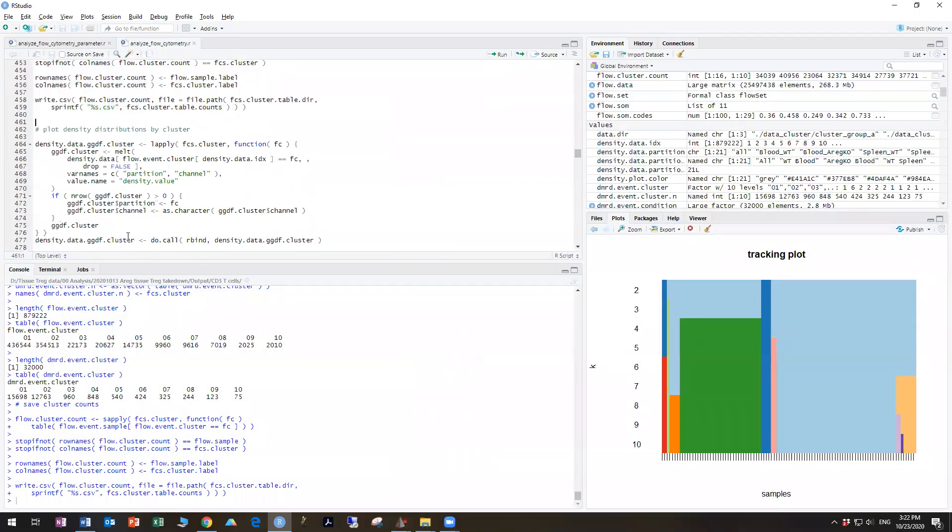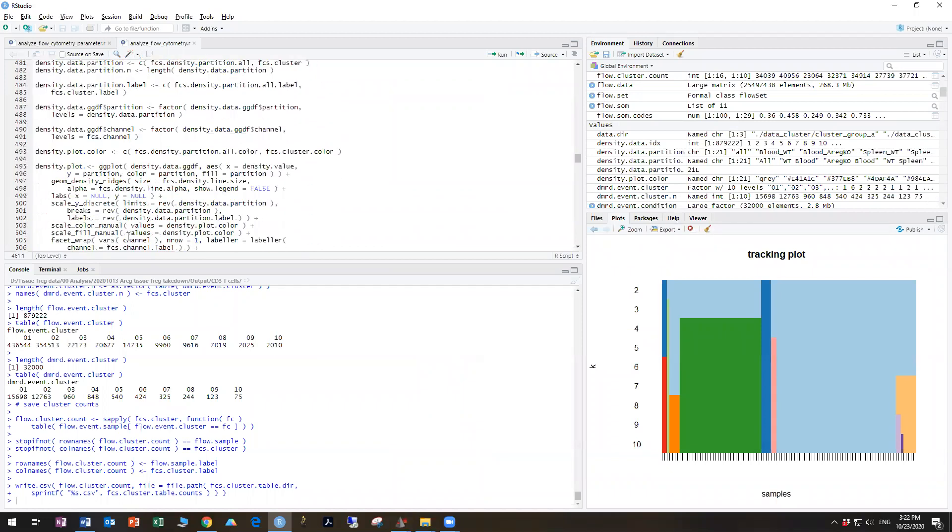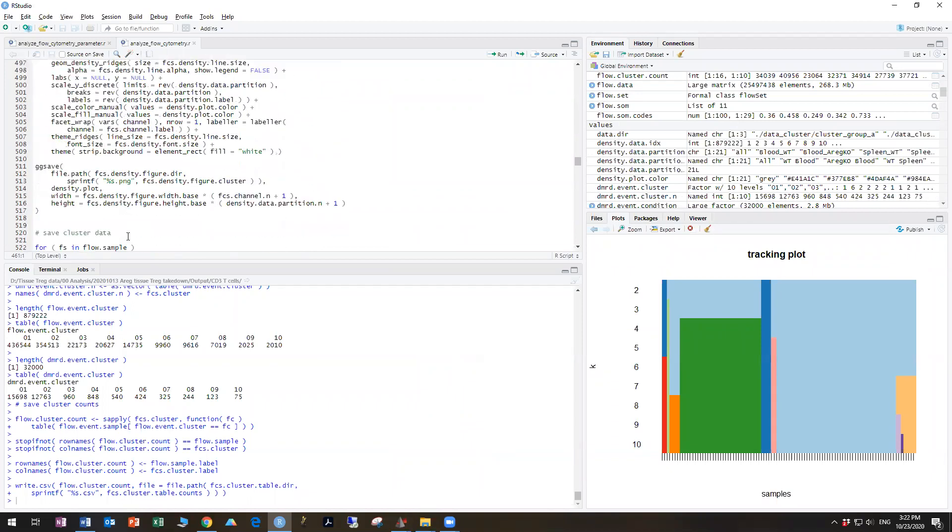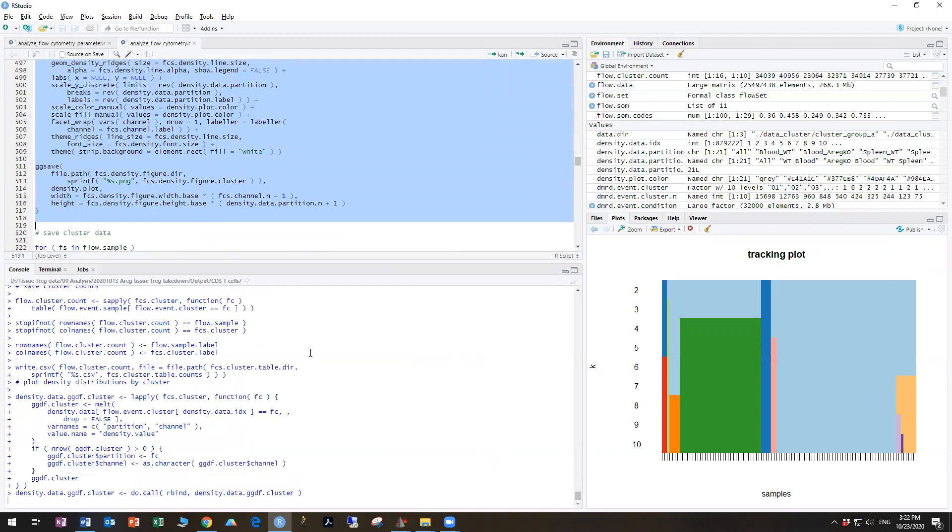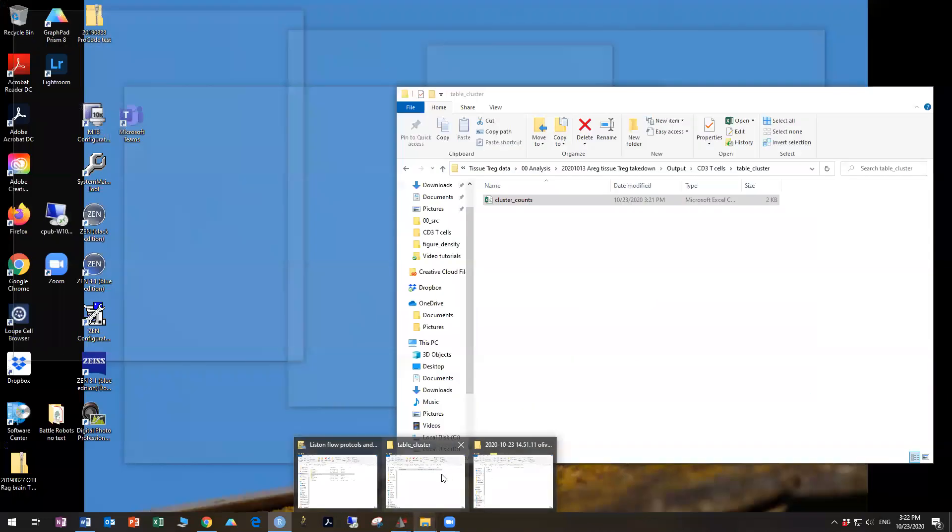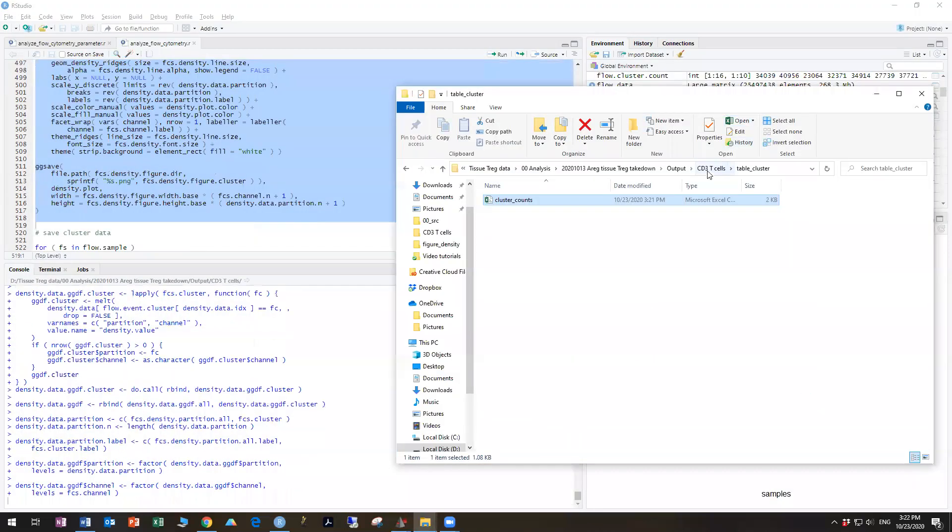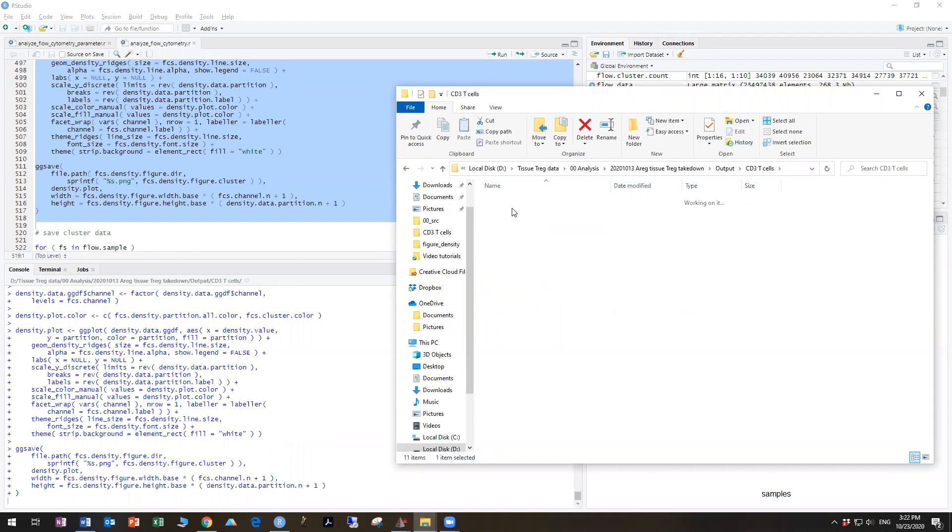Right, and then we're going to do a data density plot again. So we're going to plot histograms of the data. And the difference here is, rather than plotting the data per sample, we're now going to be able to plot it by cluster. So we're going to see what those clusters are.